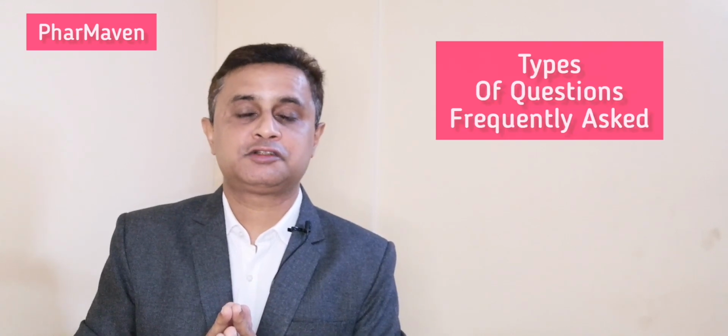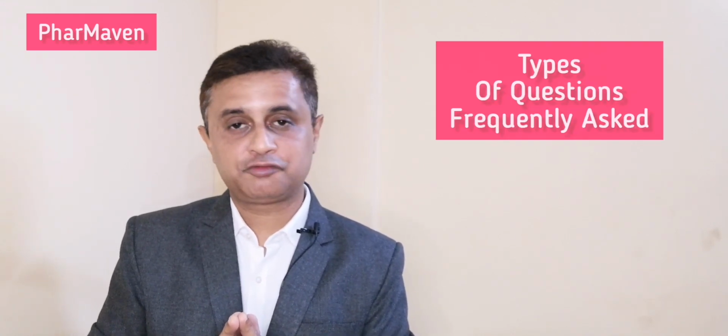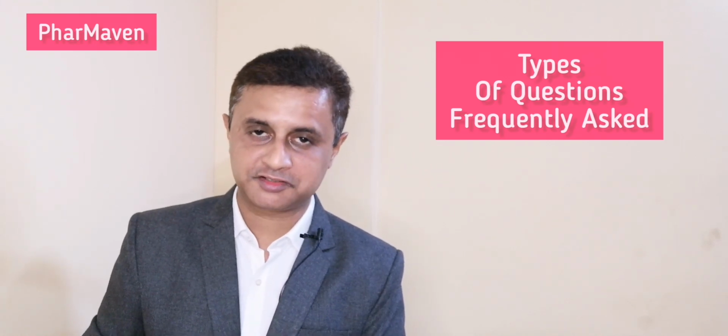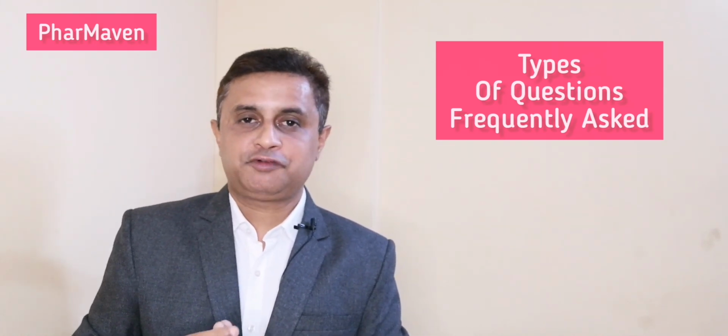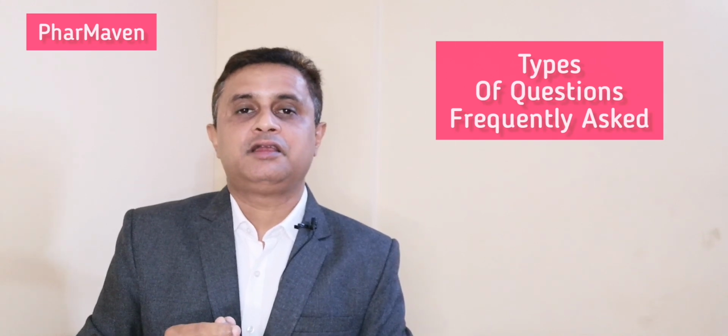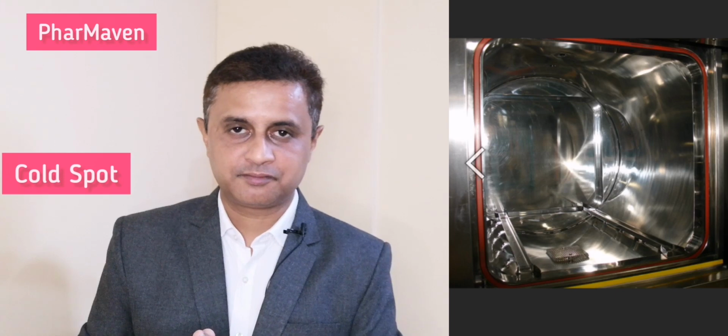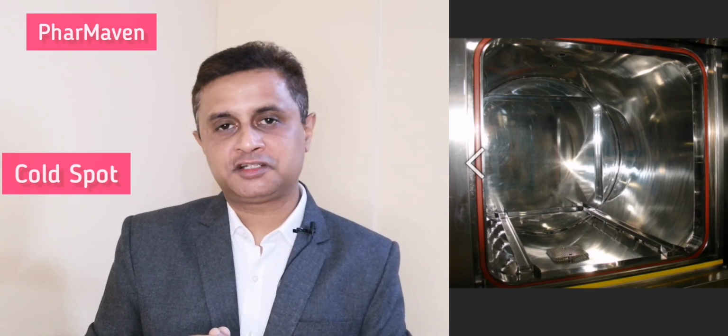Now I will discuss the most common questions asked by the inspector while they review the autoclave validation. The first question is usually, have you determined the cold spot in your autoclave chamber? As part of qualification, it is a requirement to determine the cold spot within the chamber.